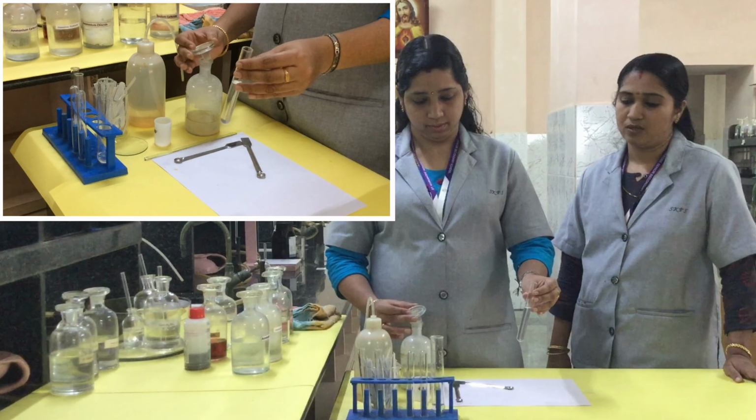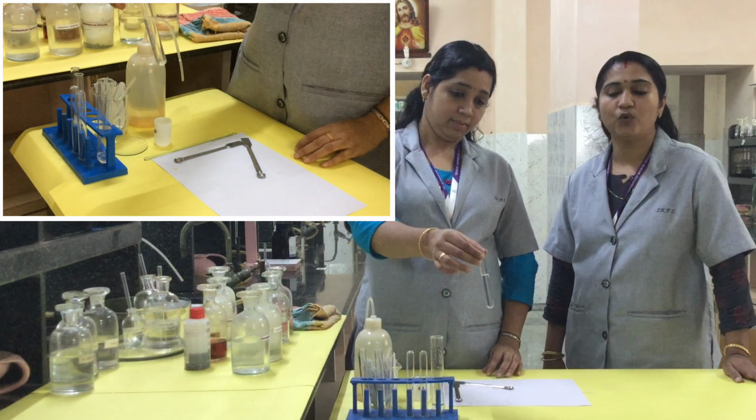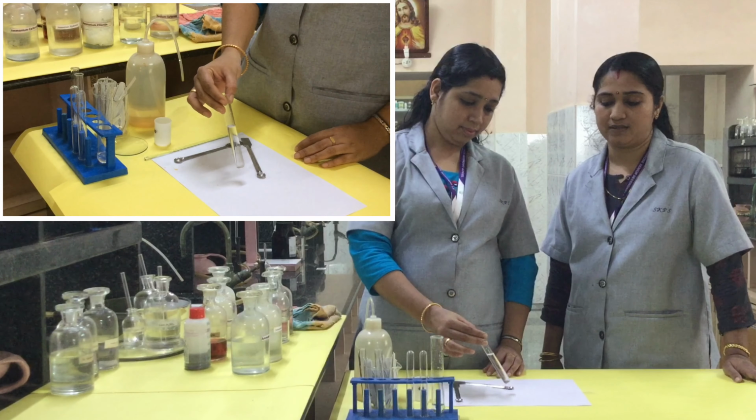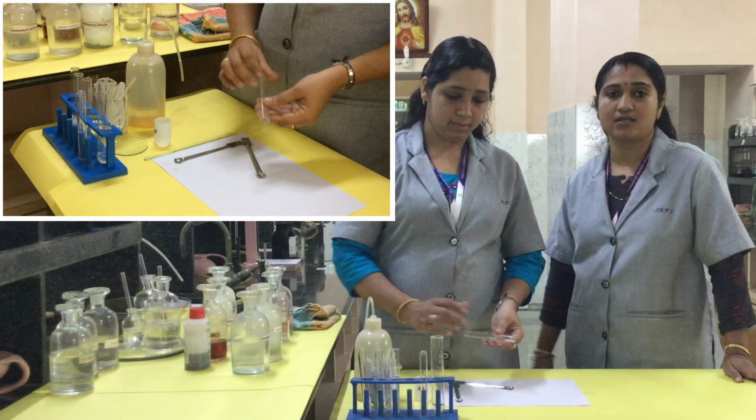There is no white residue formed, no residues formed. So group 4 is also absent. Zinc is not present. So we want to analyze the next group, group 5.